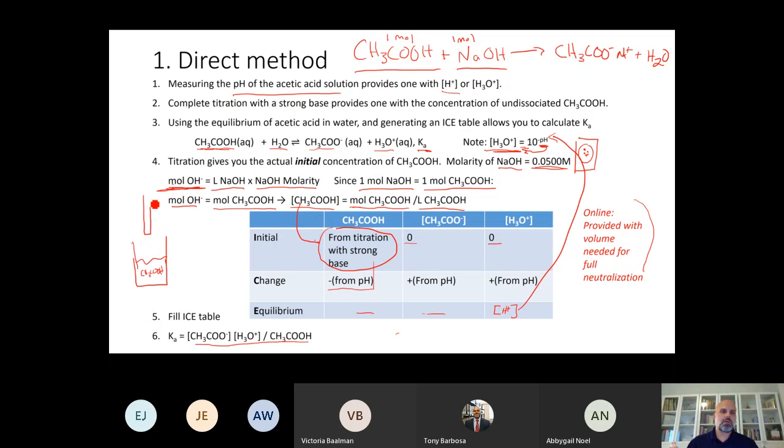we have our sodium hydroxide solution that we're dripping into the reaction mixture. We're going to have an indicator in here, right? The phenolphthalein is an indicator, and it has a color change that occurs during that titration moment. If you read through the lab report, we would see that color change, and at that color change point is the volume that we would read off of here to get our volume of sodium hydroxide that we added in order to do the remainder of the calculations.